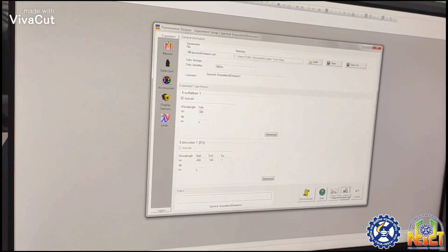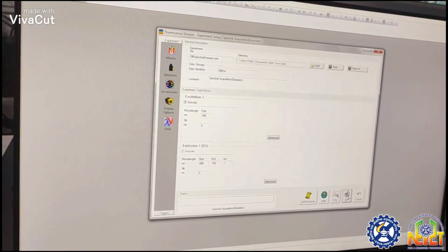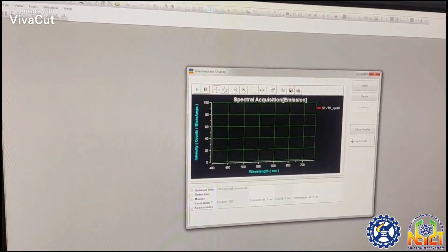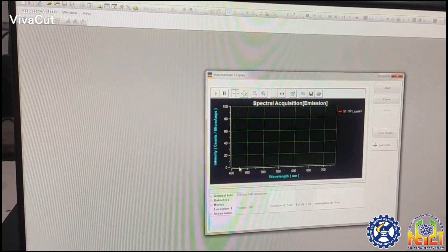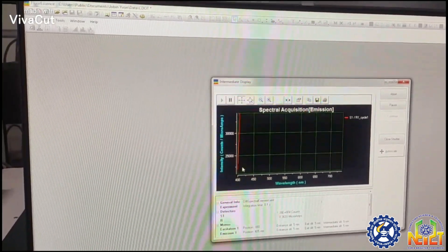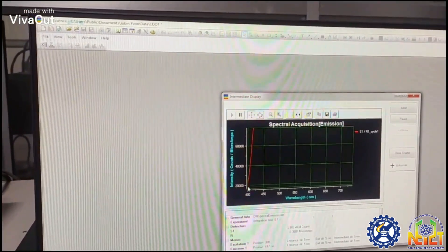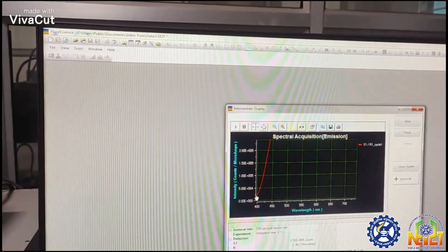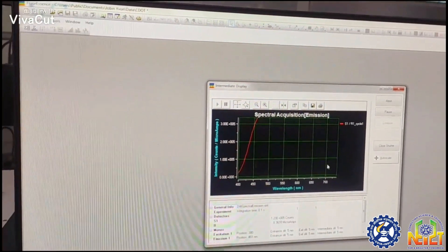Now we run the experiment and the spectrum is generated. Initialization is going on, and you can see the output spectrum being generated from 400 nanometers up to 740 nanometers.